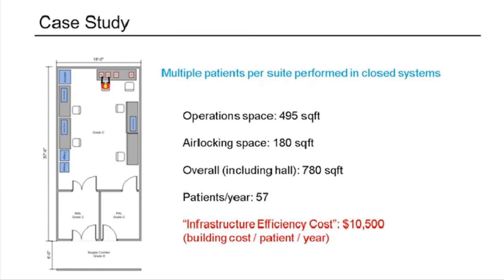So the cost listed here is not necessarily the lowest cost per patient. I think that's because we're considering that there's only 3 systems within that room, and we're considering that you're doing expansion within those systems, so you're limited in that sense to how many patients per year you can go through.